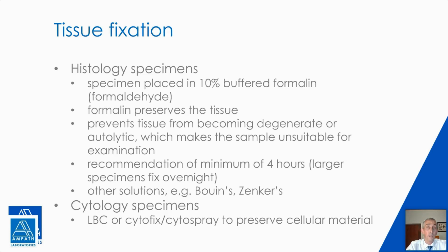Concerning tissue fixation for our cytology specimens, as I've already shown, we have liquid-based cytology fluid for our pap smears and for non-gynecologic cytology samples. But if tissue is aspirated and put on a slide, one can use cytofix and cytospray to preserve the cellular material.